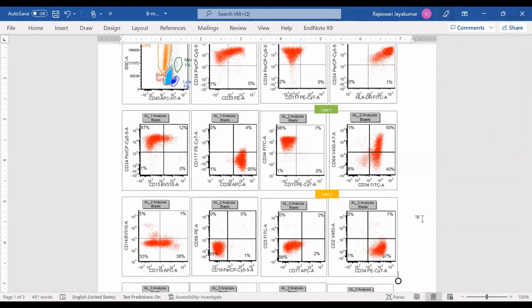So here we have both the B lymphoblastic markers and the monocytic markers. So this satisfies the criteria for mixed phenotype acute leukemia, B-myeloid type. Here the myeloid component is the monocytic component. And if you have tissue, or if you have the bone marrow biopsy specimen, you can also perform lysozyme or other monocytic markers to see their expression on the blast.